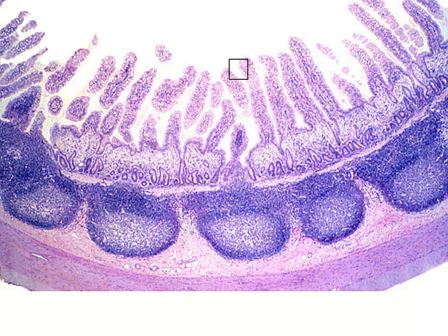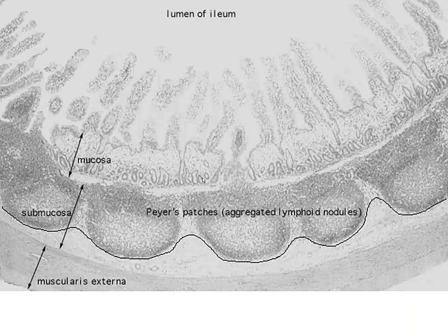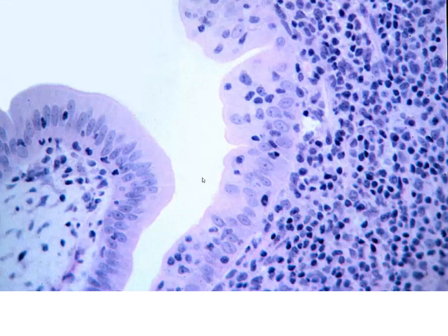So in the villi, in the lamina propria, we're going to see quite a large accumulation of lymphocytes extending up and away from these secondary lymphoid nodules, and many of these dark nuclei that we see staining in the lamina propria part of the villi, even extending up and being in between our columnar epithelial cells, are going to all be lymphocytes.